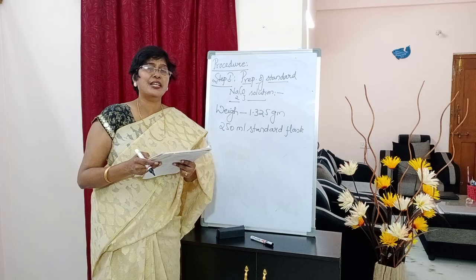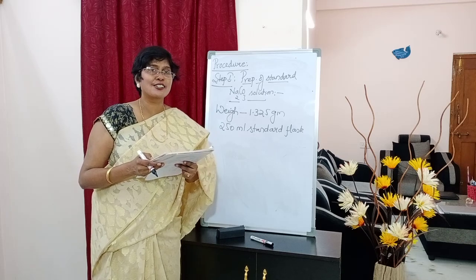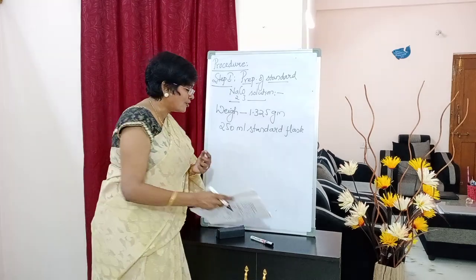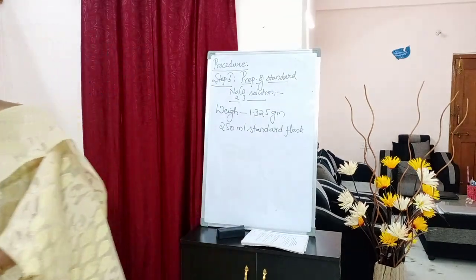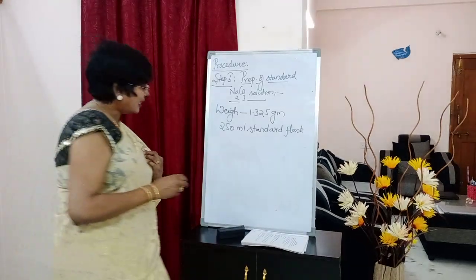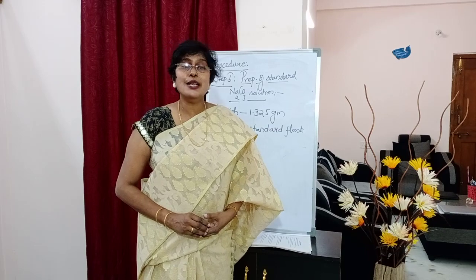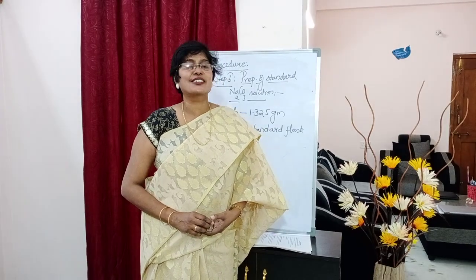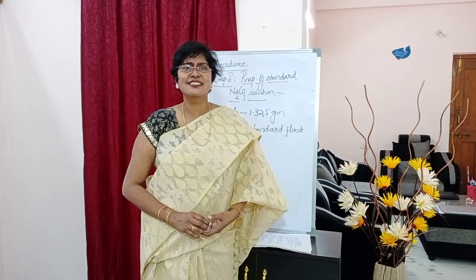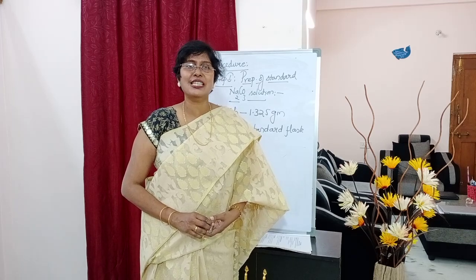What is that? Preparation of a standard Na2CO3 solution. So how is this solution prepared, students? See, look here. What is given in the procedure? Weigh about 1.325 grams of Na2CO3. Where will we weigh? And how will we weigh that amount of the substance?